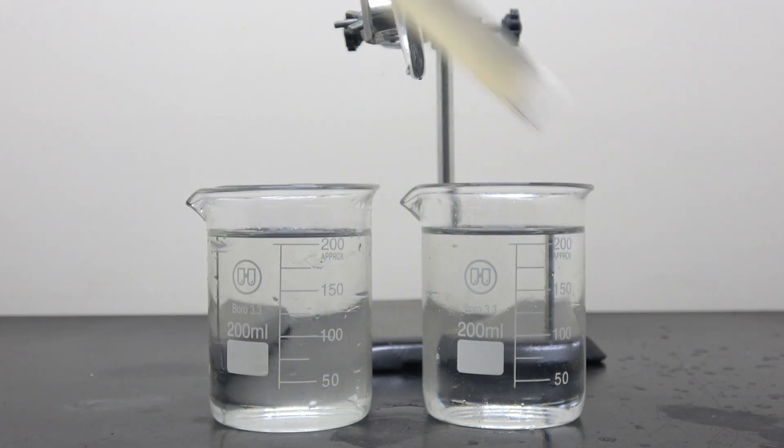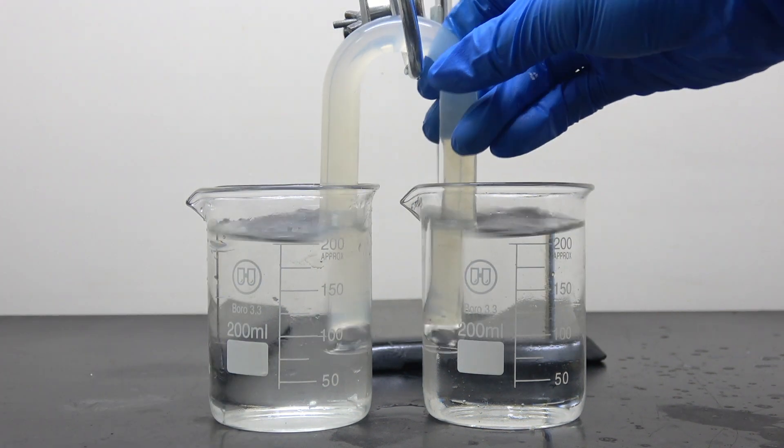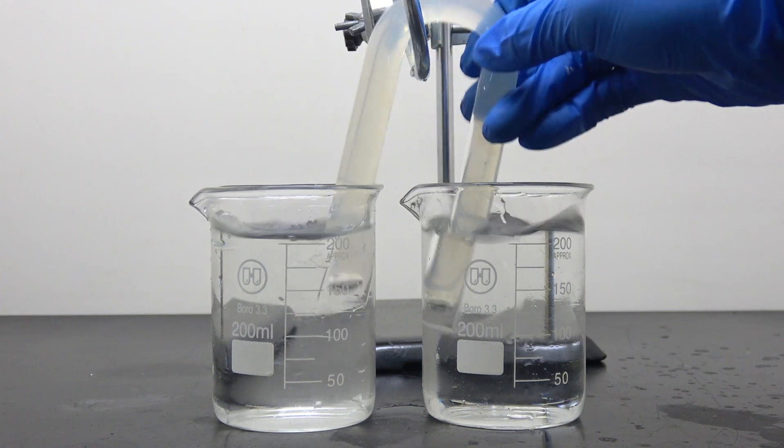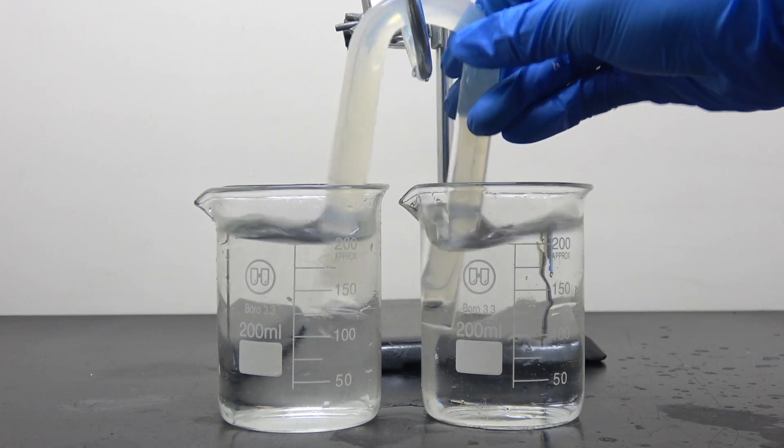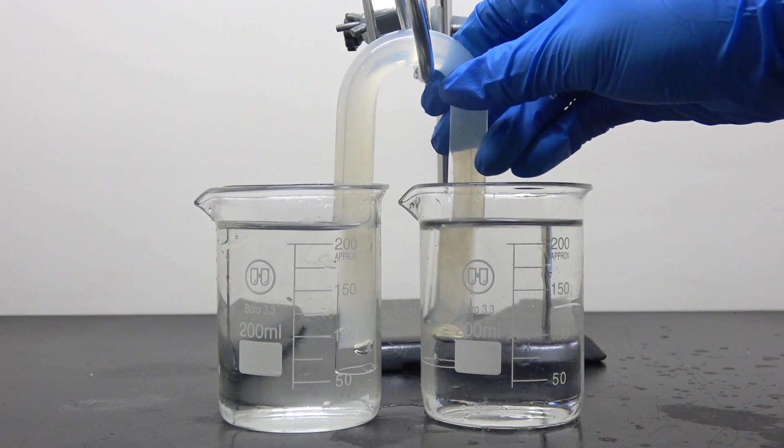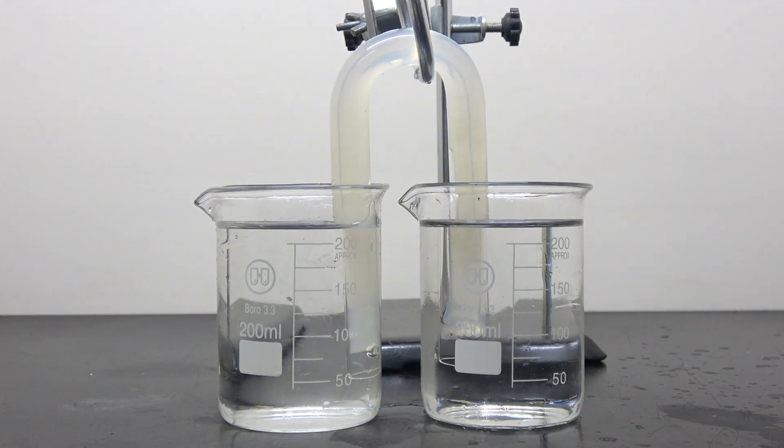The salt bridge is placed in between the two beakers, in a way that the two ends of the salt bridge are submerged by the solution. Make sure to remove the air bubbles trapped within, as air is not a good conductor of electricity.